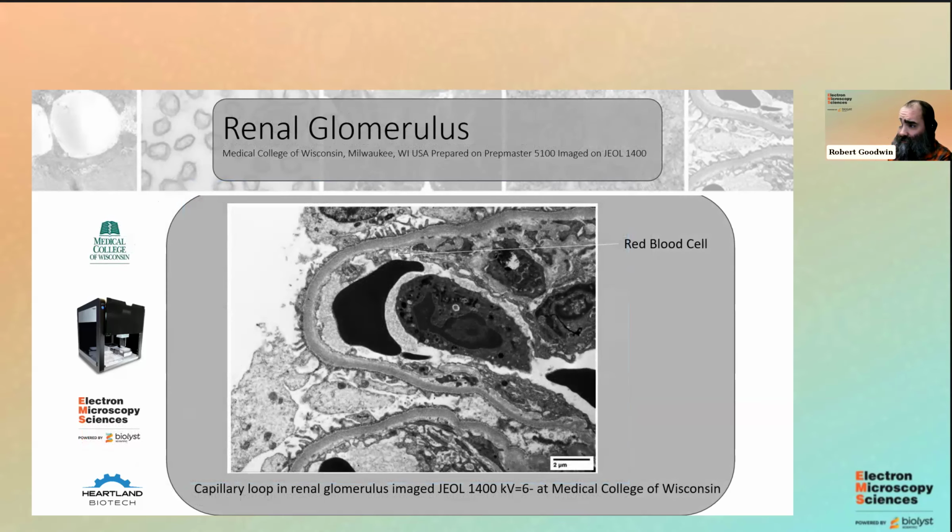And just kind of a standard renal biopsy. The renal biopsy's contrast is very key. You can see some variation in the basement membrane of the capillary loop there. That's one thing that they do look for. But we look for a lot of deposits, and sometimes they can be very subtle. So if I'm not getting the contrast I need, because things aren't in chemicals too long, or just various reasons, but consistently we get the same results. I never have one where it's like, oh yeah, this is not good.